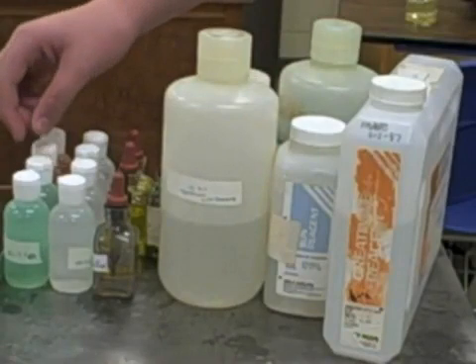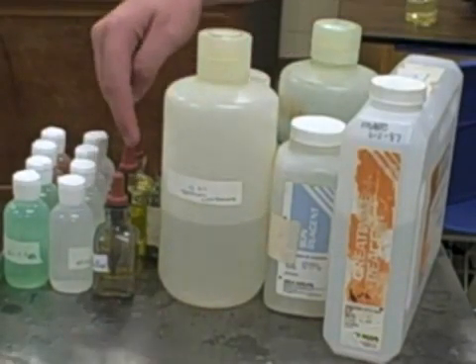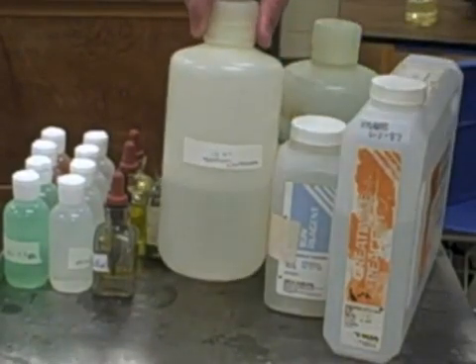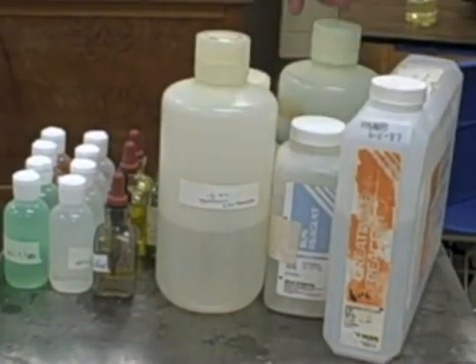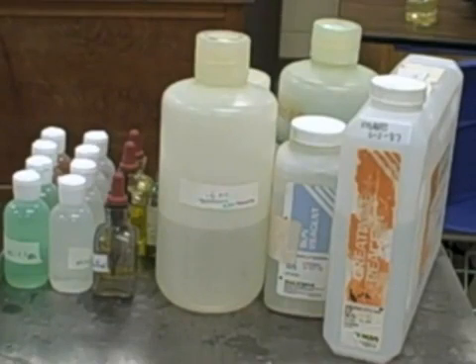We've got iron chloride, nickel chloride, sodium chloride, sodium phosphate, potassium chromate, silver nitrate, potassium iodide, sodium carbonate, lead nitrate, copper sulfate, and sodium hydroxide. So you can see that there's a bunch of different combinations that those can go in. And most of those will precipitate. So we're going to get quite a few precipitates here.